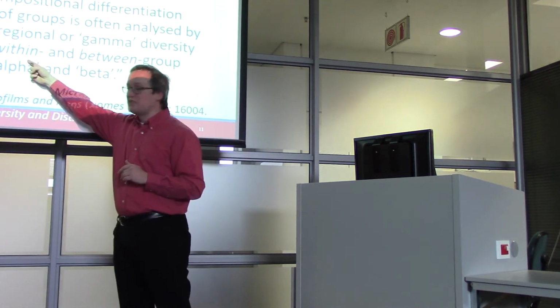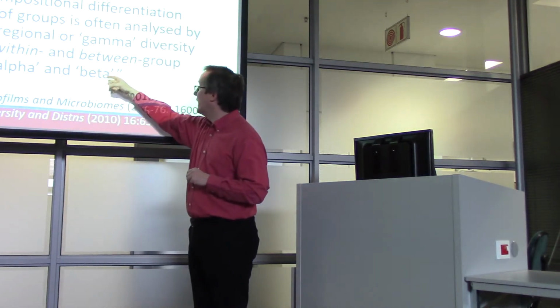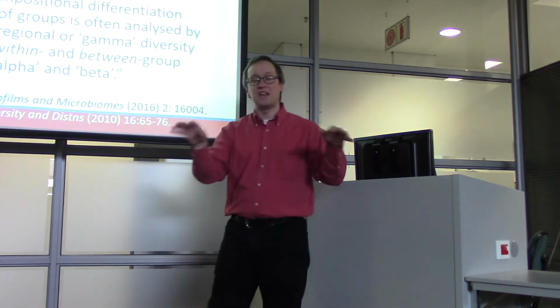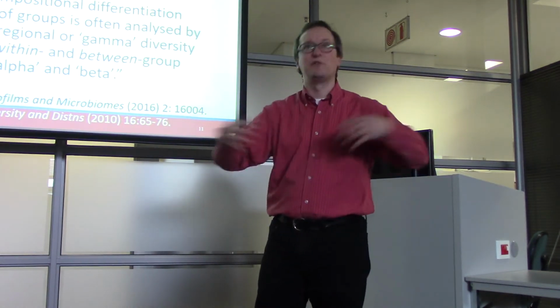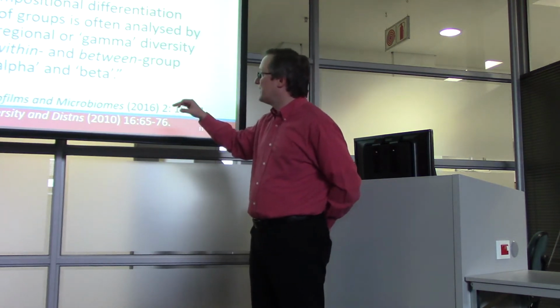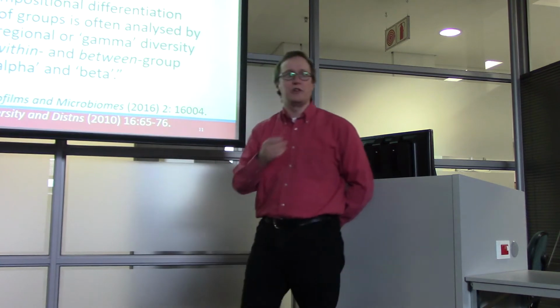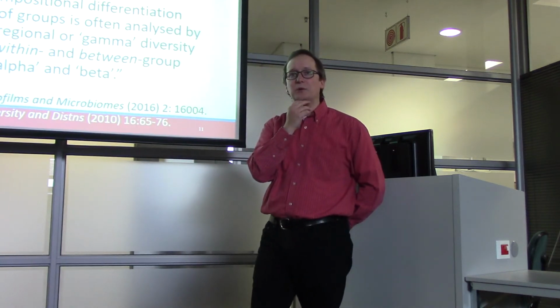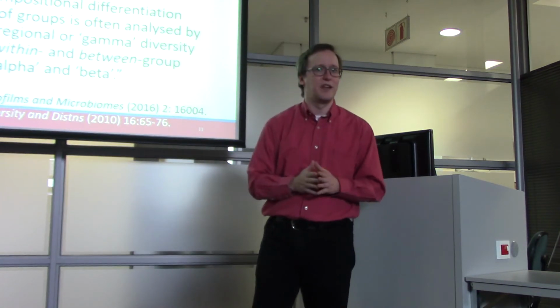Alpha diversity represents the amount of diversity we have within an individual sample. And beta diversity tells us how much variation we have among different samples, different groups actually. So that's a gross simplification. If you were to read this 2010 article, I think you'll see that some of the math that we would use for evaluating diversity is actually quite a lot more complex than that.